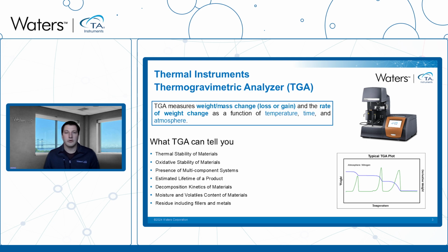First is our thermal gravimetric analyzer, or TGA. The TGA measures the weight or mass change of a material as a function of temperature, time, and atmosphere. The TGA can tell you about the thermal stability or the oxidative stability of your material, can estimate the lifetime of your product, and also look at the decomposition behavior of your material.